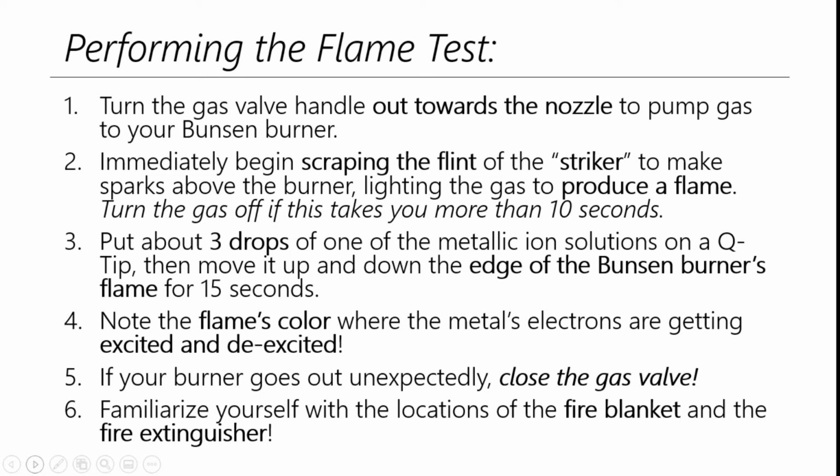So as the electrons de-excite from their excited state, they will release light, and we can make note of what color that is. And when you're done, we'll just close the gas valve. And of course, always be aware of where your fire safety stuff is. Keep your hair up and out of the way and things like that. So what's this going to look like for us?